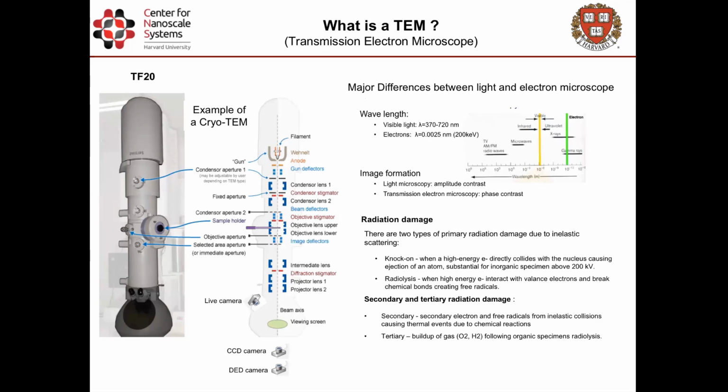Now, about a biological TEM: they are not exactly identical to the material science TEM because they have a few requirements which are not necessary for material sciences. They are though based on material sciences, and in Cryo-EM we benefit from the advances in material sciences. What is important to know is that what we really need to analyze is the phase contrast, which we cannot because you don't see anything in phase contrast. You have to introduce amplitude contrast, and we do this by defocusing.